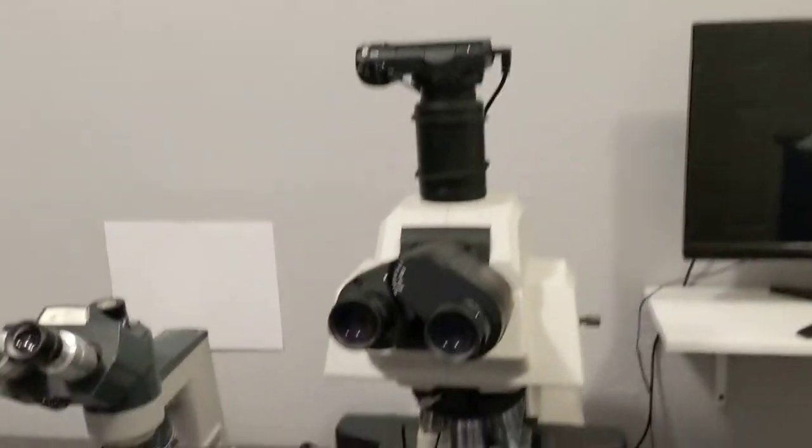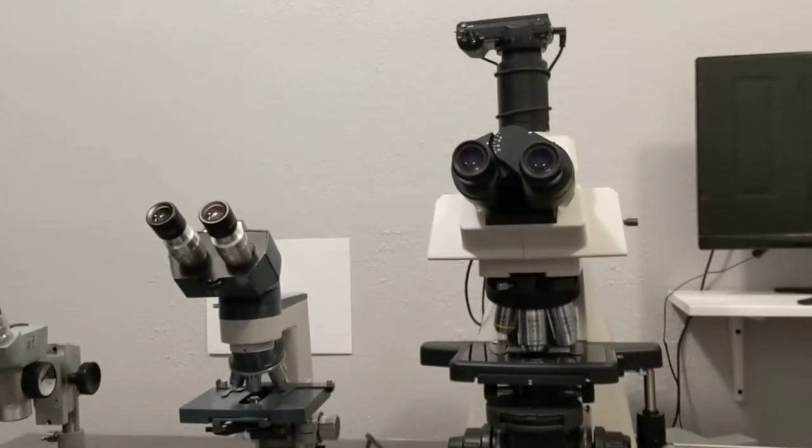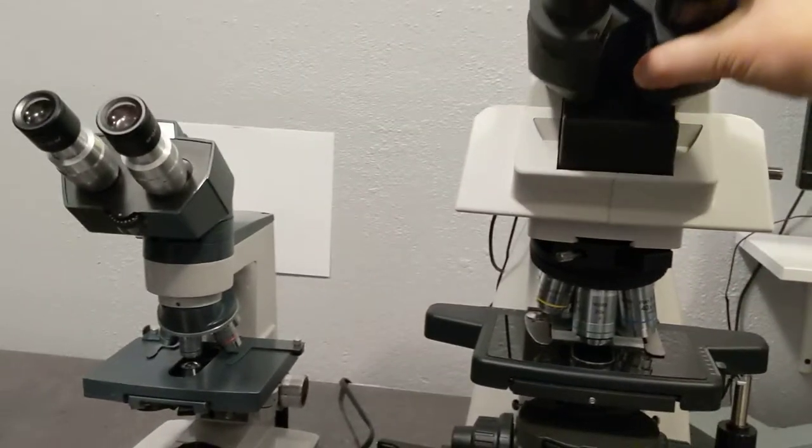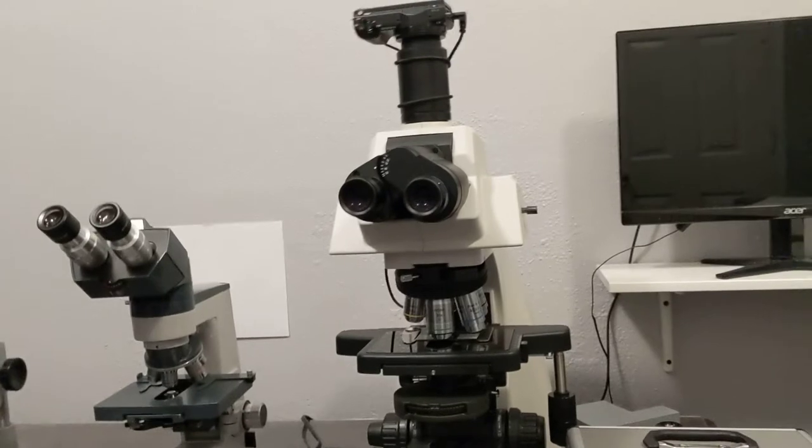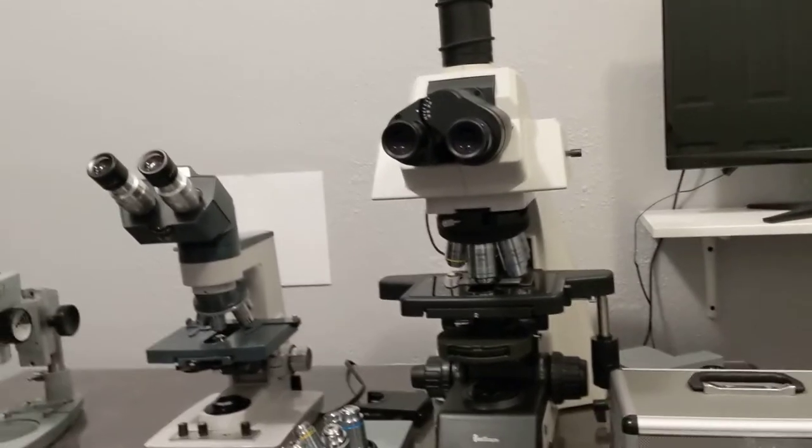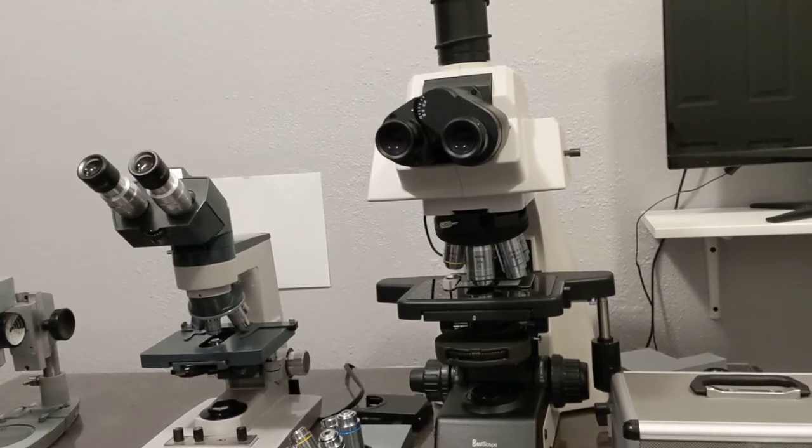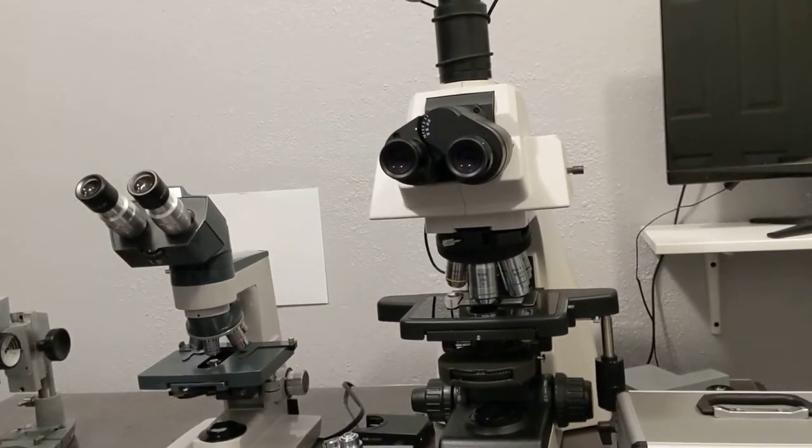You can see it's an enormous microscope. Here I have my American Optical Cycloptic, and then my American Optical 110. That's been my go-to microscope for a long time. It's a giant, much bigger than what I'm used to, and very heavy. I recommend the ergonomic eyepiece because without it, I wouldn't be able to use this without getting a taller chair.